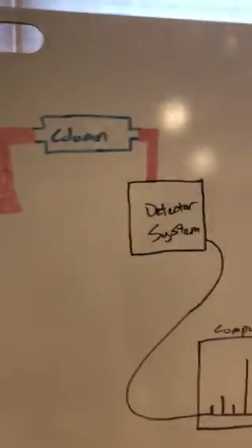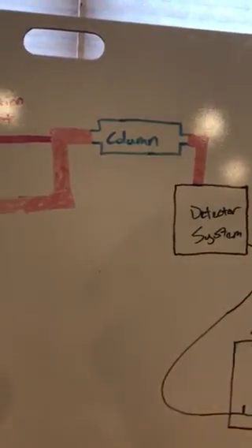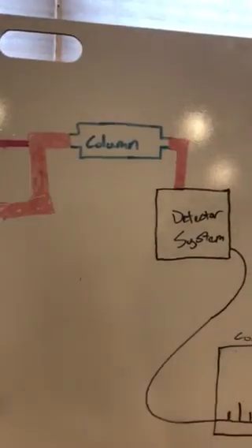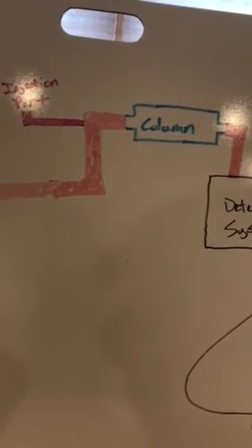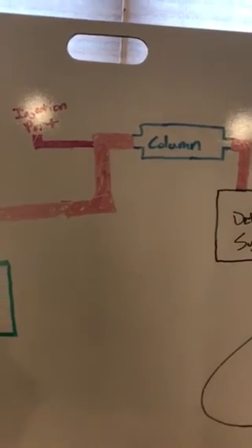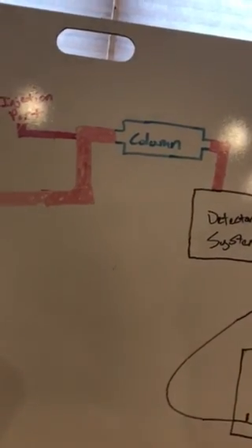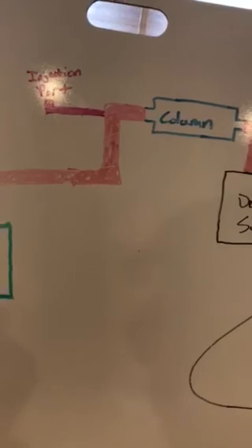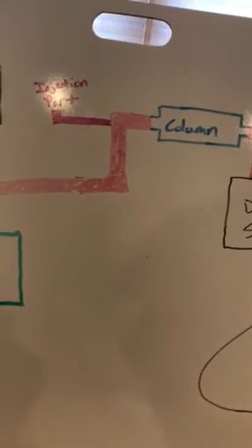Moving on from our pump, we have our column, which is our stationary phase. It's most common to have a very packed stationary phase in a small area because this increases the analyte's ability to interact with the stationary phase during the experiment. It's also important to note that it's incredibly packed because it's such a short column. It's roughly somewhere between 10 to 25 centimeters usually, and the packing allows for more interactions to occur.